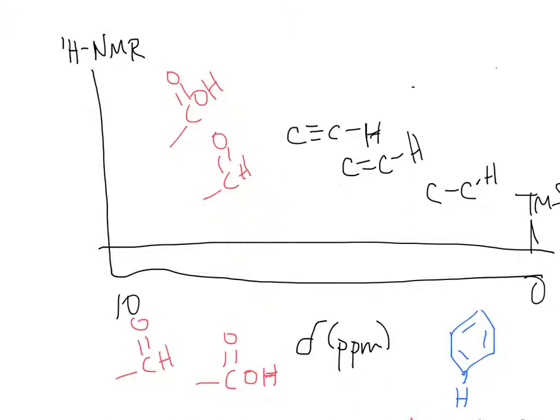It's an aromatic compound. And because of that, do you think the proton or the hydrogen that's attached to it is going to be shielded or de-shielded for the hydrogen nucleus? You can compare it not with the oxygens, but to the stuff that we've seen down here. It's more shielded, right? No, it's going to be very de-shielded, because the electrons are being pulled into the life preserver ring, so the protons that stick out are going to be less shielded. They're going to be more exposed. So the benzene ring hydrogens are usually going to be further downfield. In general, it's going to be shifted far to the left.